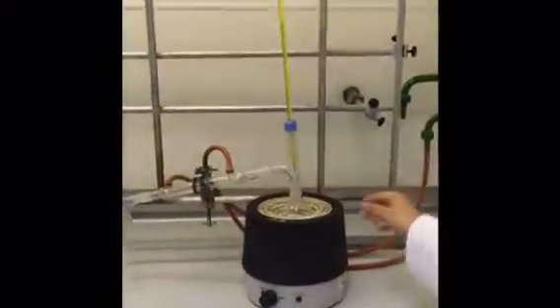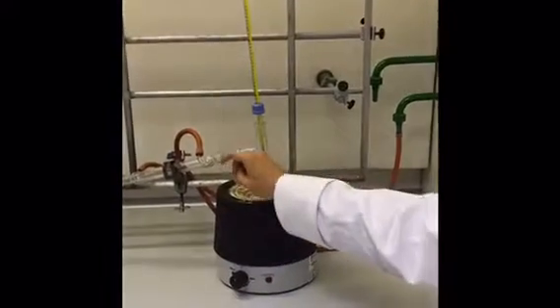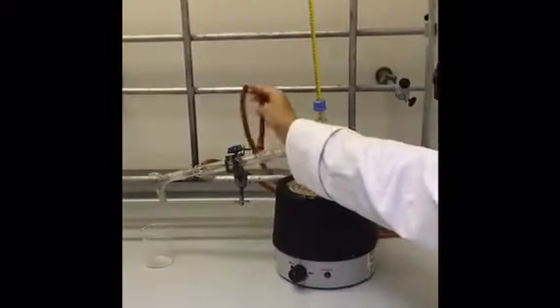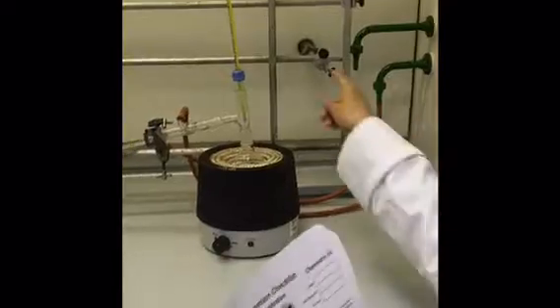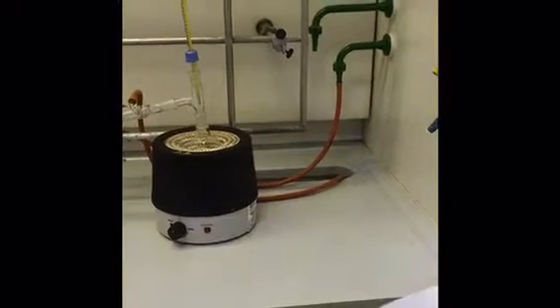So here we have the distillation flask at the bottom part. The water comes in this tube, so this tube is directed to the condenser. The first one will be the outlet for this tube. The second one will be a miniature of the key return — there will be a great flow of water to cool down the tube.